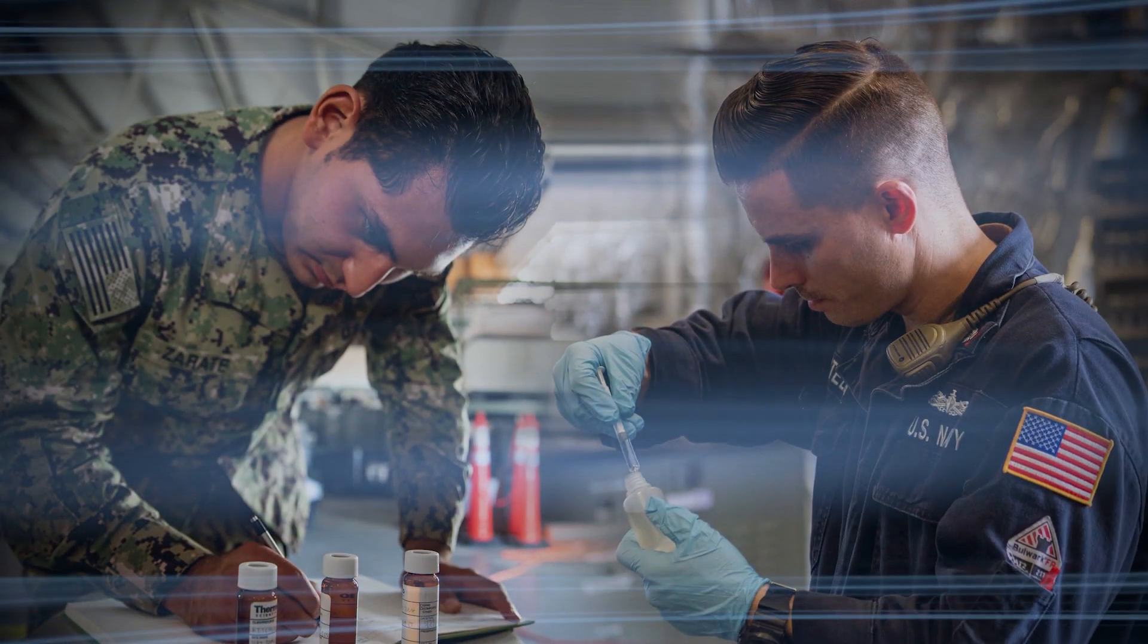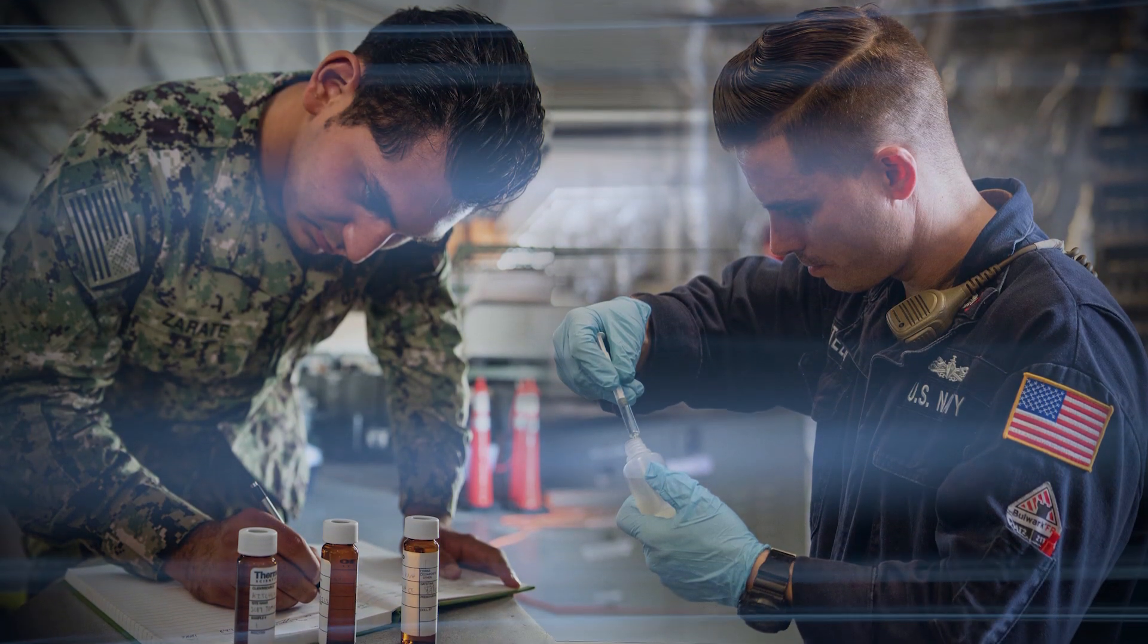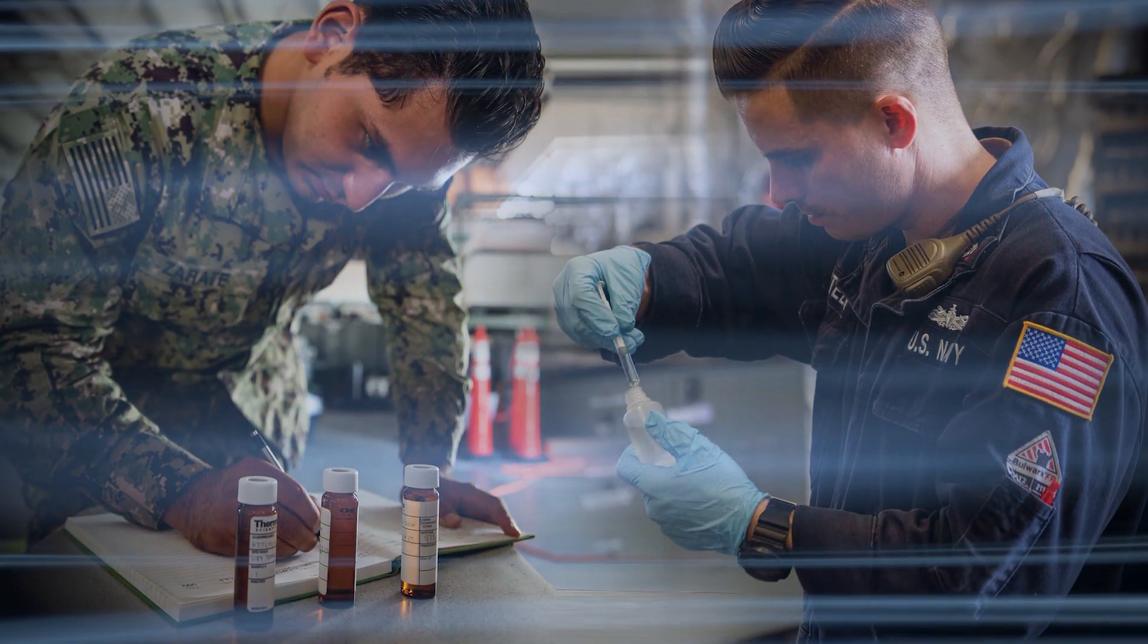Code 134.4 also assists ships force with article testing and troubleshooting product quality deficiency reports.